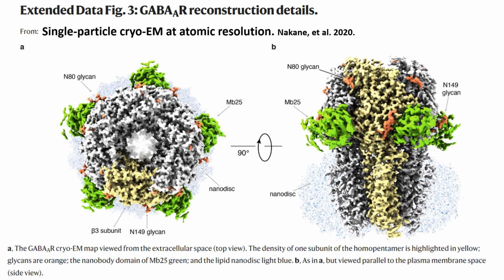The protein they examined is a human membrane protein known as GABA-AR. The figure shows the top and side views of the GABA-AR molecule. It's a homopentamer, or a molecule with 5 identical subunits that you can see clearly in panel A. I think it's a pretty dang cool looking protein reconstruction.